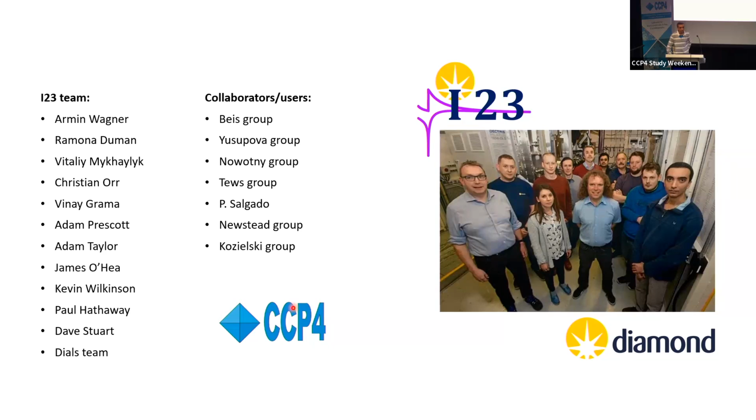But then there was also a paper on doing it with bromine, which I can give you, from about 2004, I think. I think it was Ramagopal. Does anyone remember? I've got it on my laptop. I'll give it to you. But yes, it's a way you make a hole basically, so it's sort of reverse MIR. Actually, bromine will be very useful for nucleic acids also, because quite often you can synthesize nucleic acids with bromine for phasing.